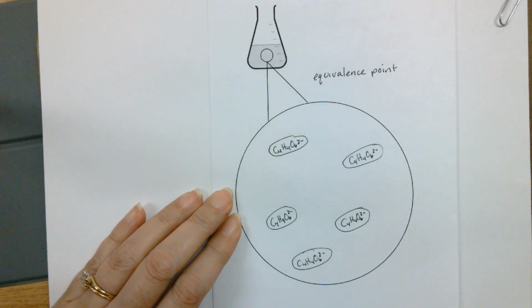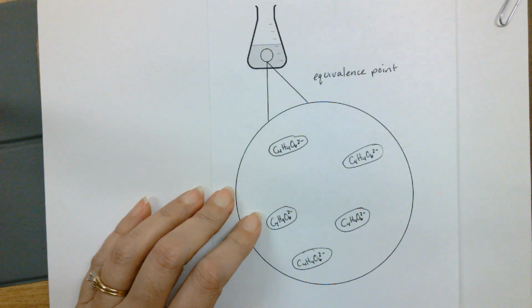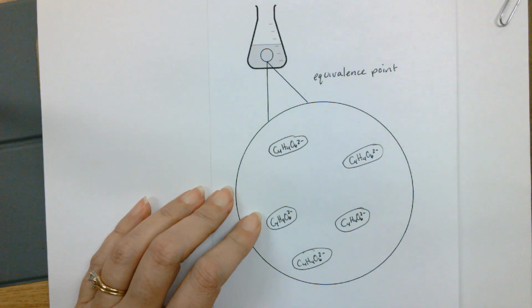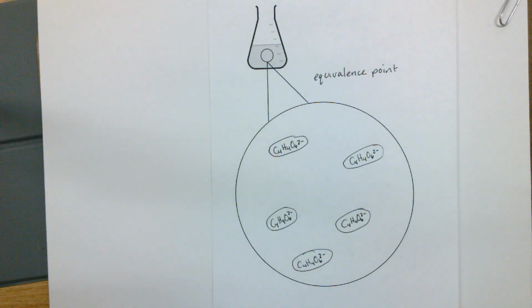All of the OH that we have added has reacted. All of the hydrogen tartrate ion I had has reacted. And so all we have is our spectator ions, sodium and potassium, and the tartrate ion that has formed. At this point, it was still clear and colorless.